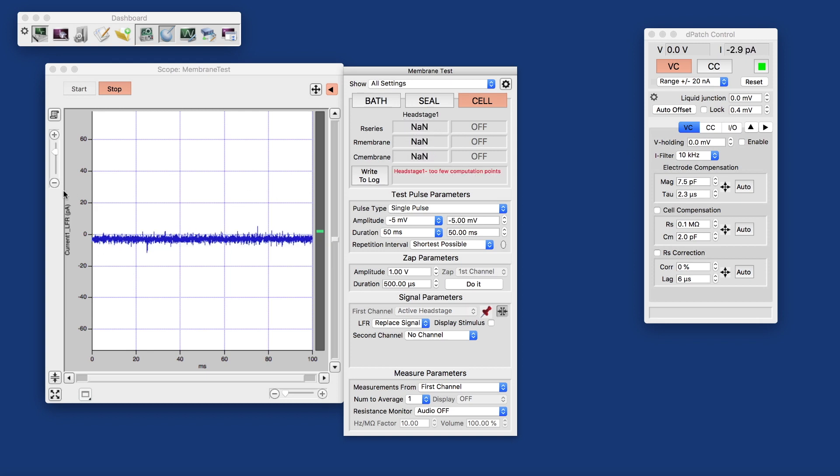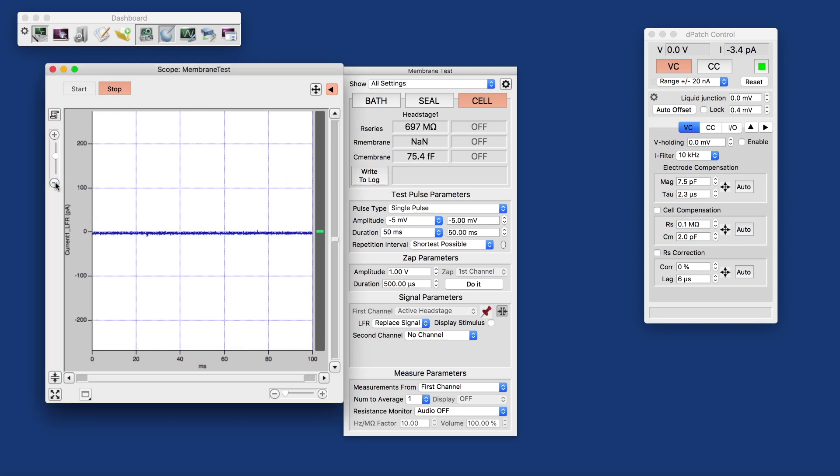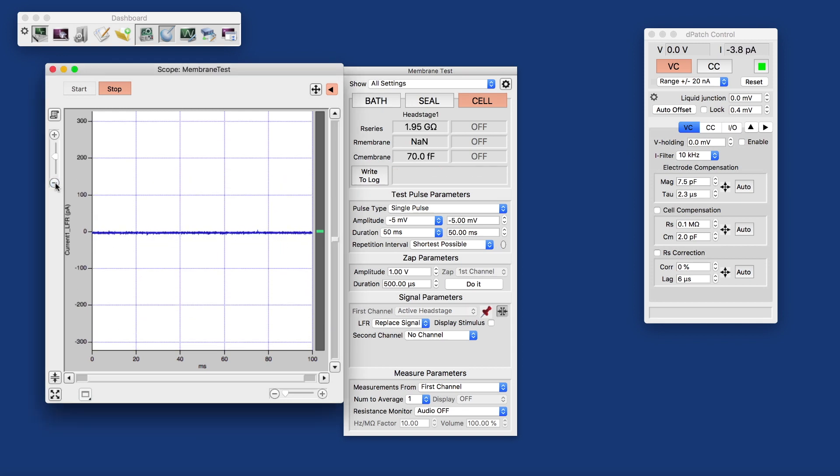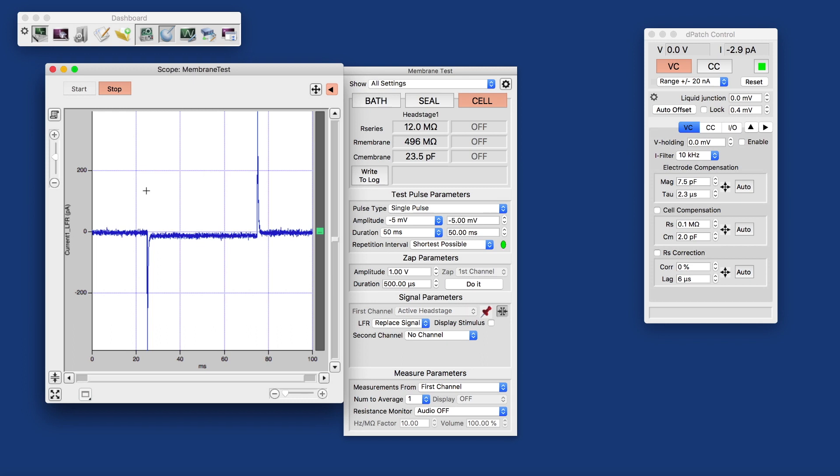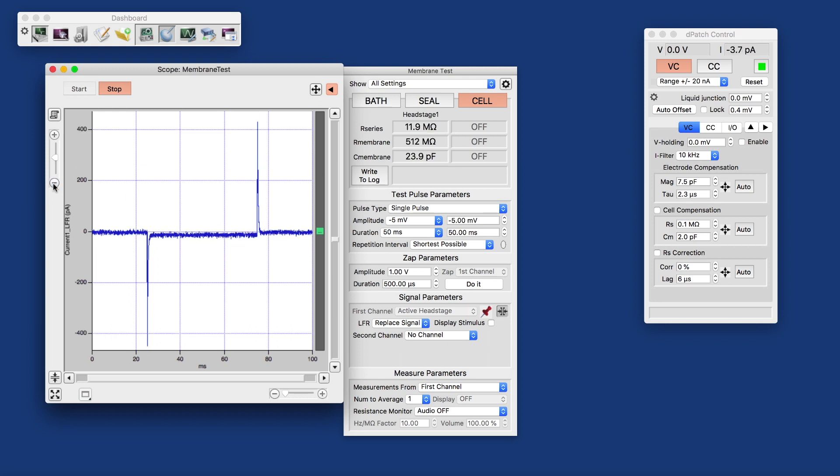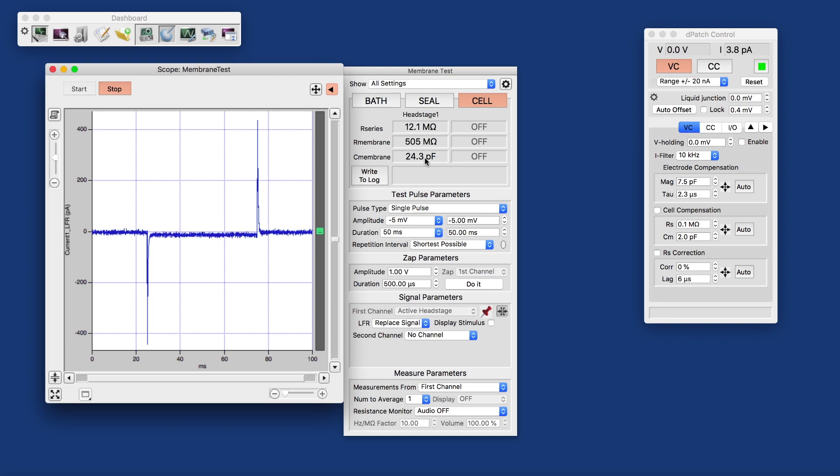And I will zoom out on the y-axis a couple more times because we're expecting the capacitive transients to grow dramatically as we break in. Which means we switch the model cell to cell mode. And here we have the larger capacitive transients. Here we have our about 500 megaohm membrane resistance with a 25-ish picofarad transient.